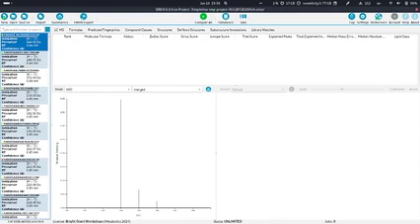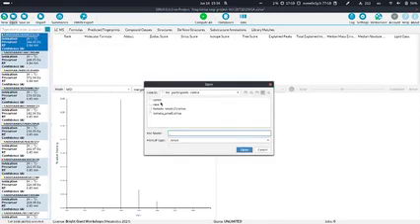Okay, what we are going to do instead is load the pre-computed results, which you have all downloaded. To do this, we just use the Open button. Now we have to navigate to the folder where you have the pre-computed files. If you are in the For Participants folder, you will have one file named tomato_small.sirius, and this is the project space. I think this is also by far the largest file. So I hope everybody has downloaded this.